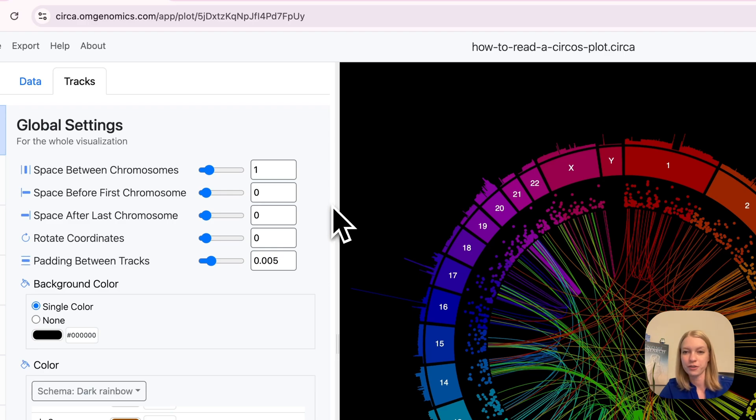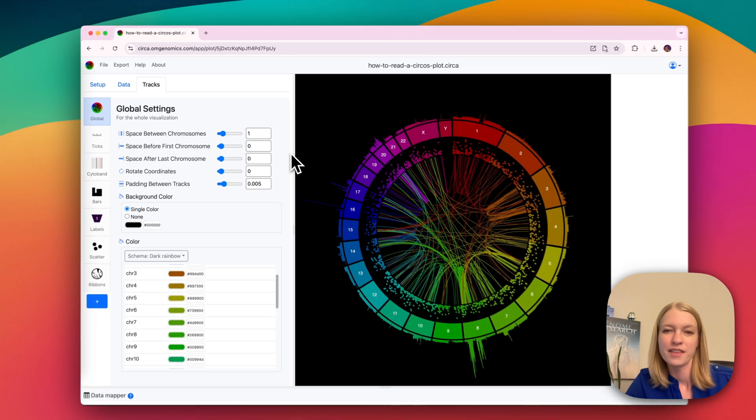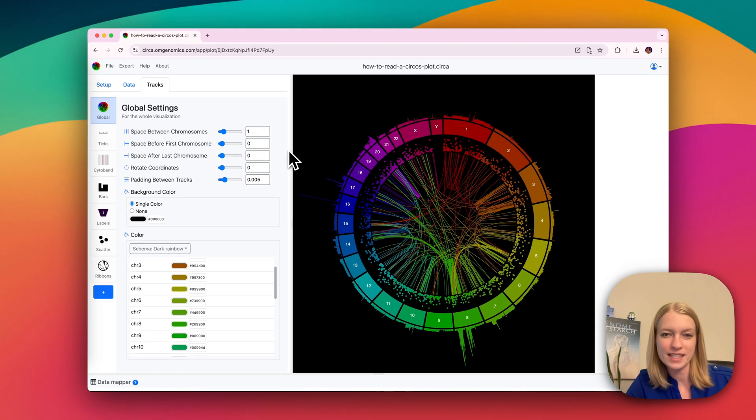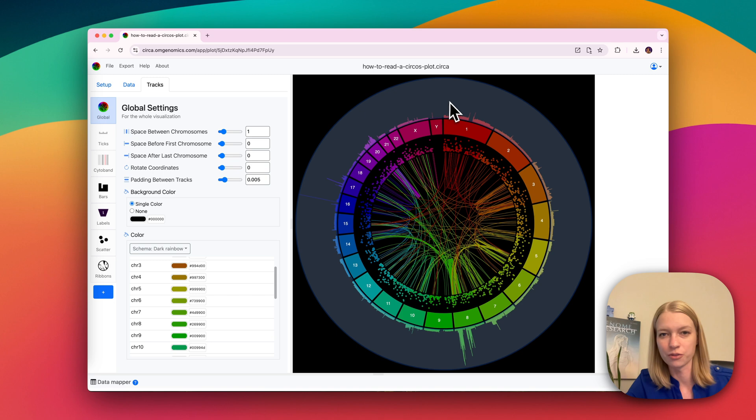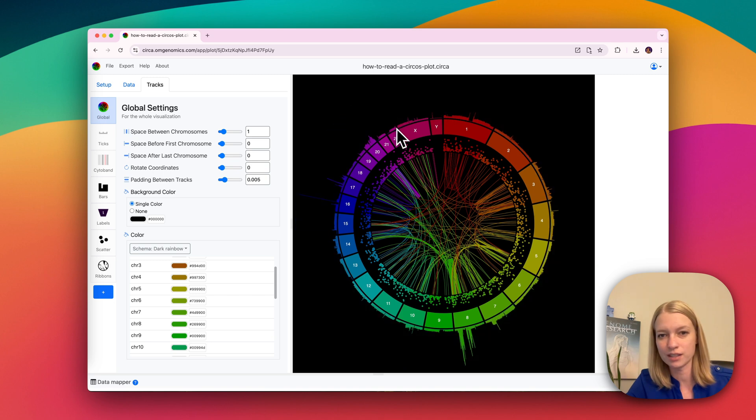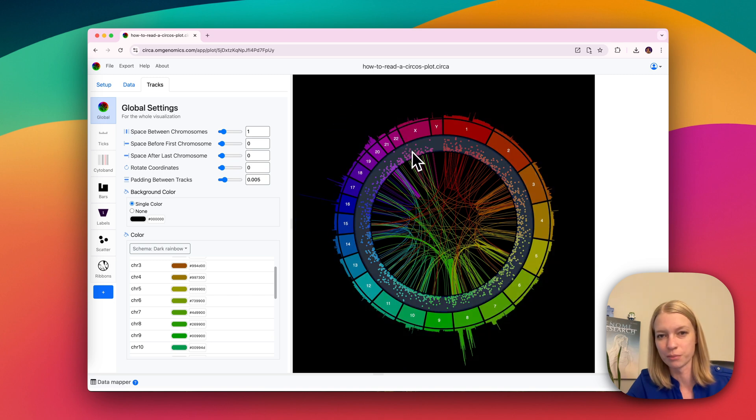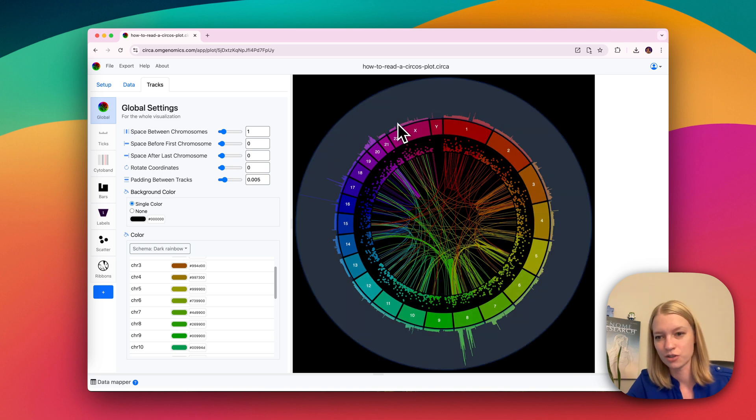Let's go over how to read a Circos plot. The basic vocabulary is that a Circos plot contains tracks, and if I hover over them here, you can see each track.